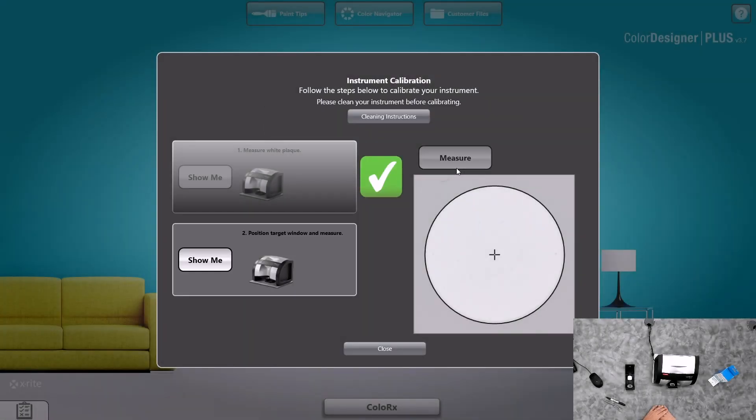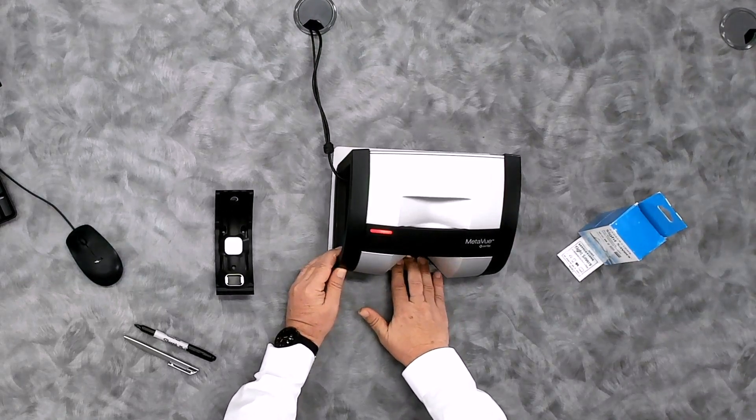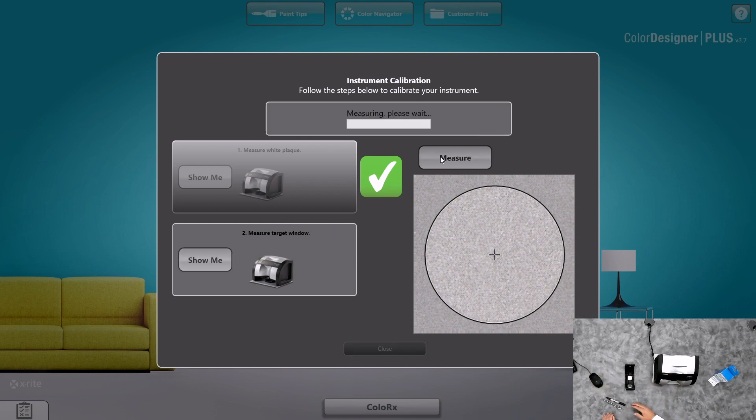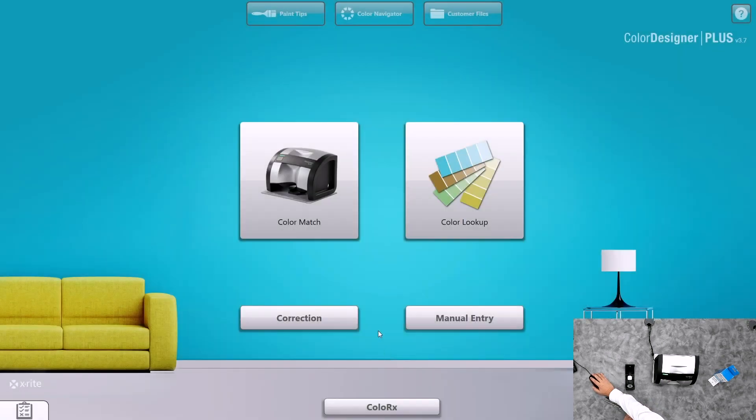Once the calibration is complete for the calibration plaque, we'll then calibrate the target square. Same procedure — you'll clasp on and then push the calibration plaque backwards to get into the target square. The target square has the same function: if it is not in the proper position, the measure button will not appear. Place it into the proper position, it locks in, the measure button appears, and we simply click on measure. Once complete, you'll be able to hit close and then begin with your color measurement.